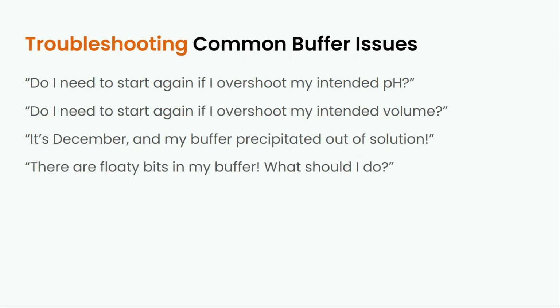And then this happens quite a bit as well. You come to your buffer, you give it a swirl, and there's stuff in it. What should you do? Well, you should probably tip it away. If it's an experiment where your life depends on it, it's a really critical one, just throw the buffer away. That floaty stuff is probably fungus.